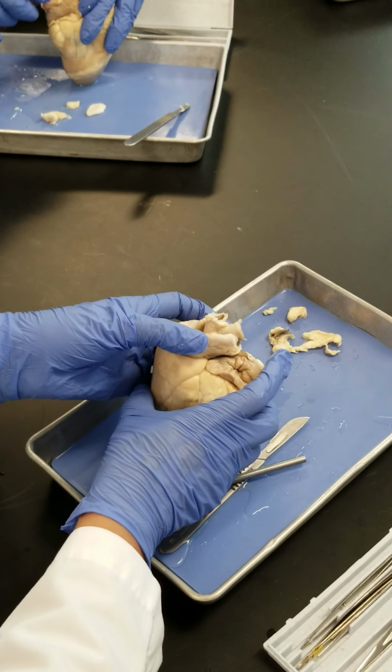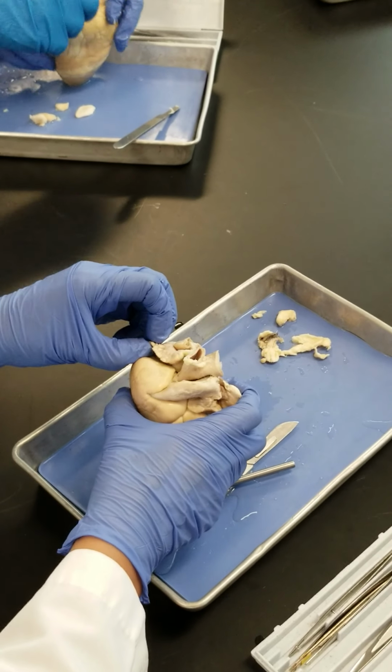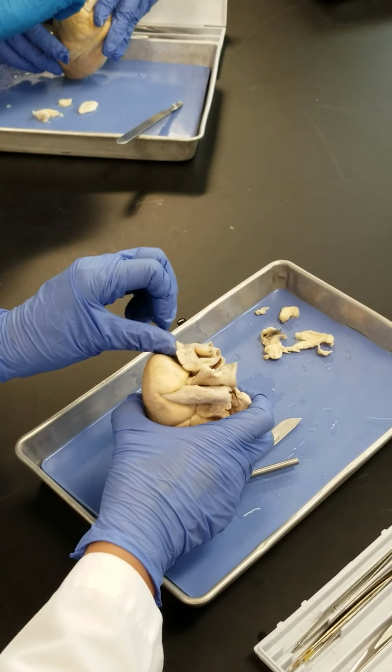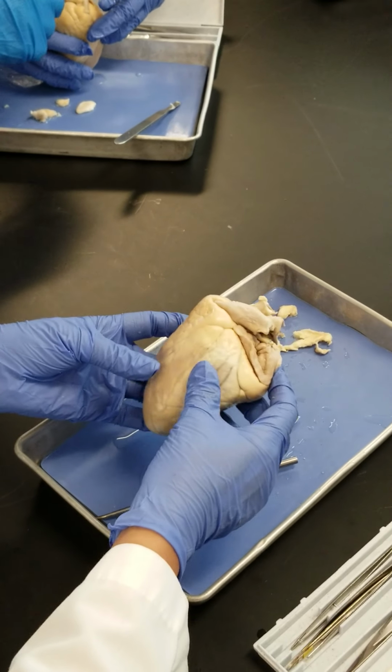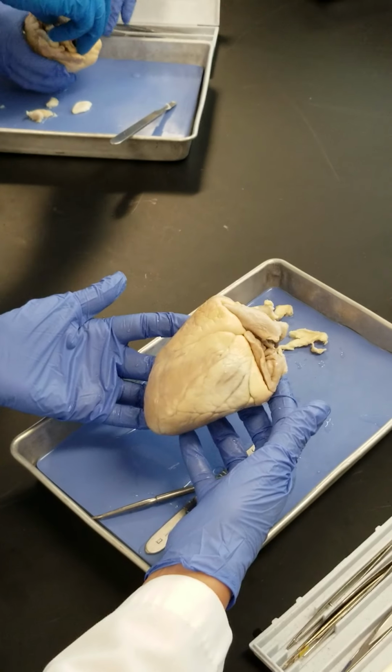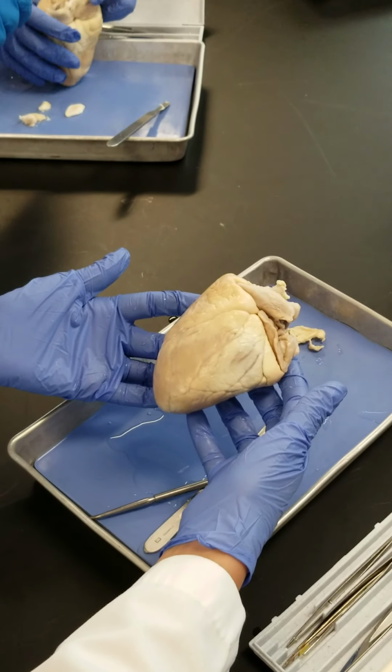Too much fat. We can't see anything here. And this is the auricle of the right atrium, right? It's here. It's just covered in fat. So that was all the things you see from the anterior side. Any questions regarding the anterior side?